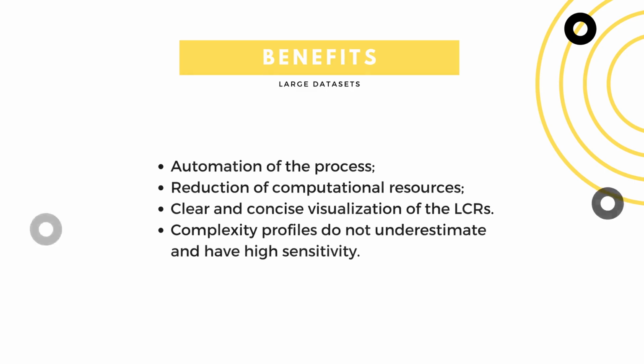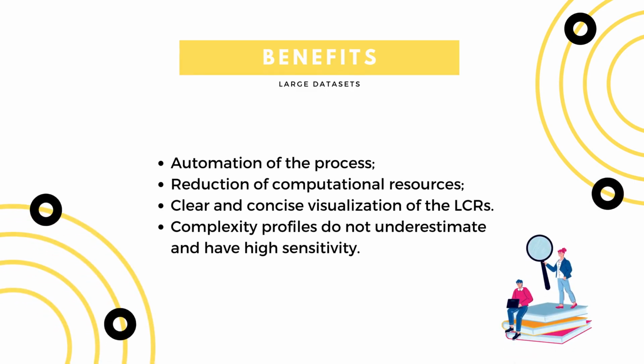Using AlcoR for mapping LCRs in large genomic data provides several benefits, including automation of the process, reduction of computational resources, and visualization of the results in a clear and concise manner. Furthermore, since the method is based on data compression, the complexity profiles do not underestimate while still having high sensitivity. This can help researchers quickly identify and quantify LCRs in their data, saving time and increasing efficiency in their work.